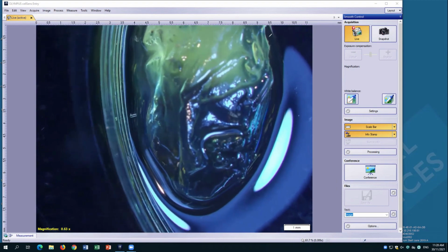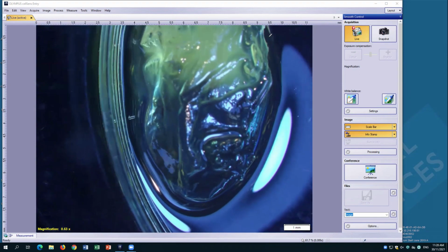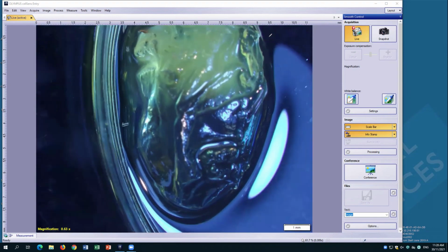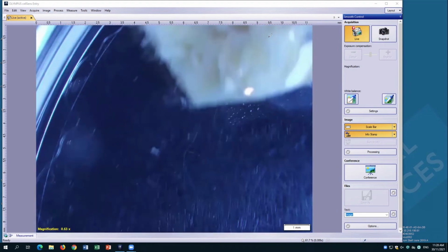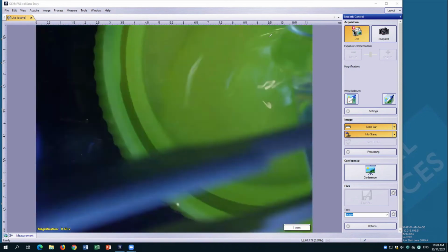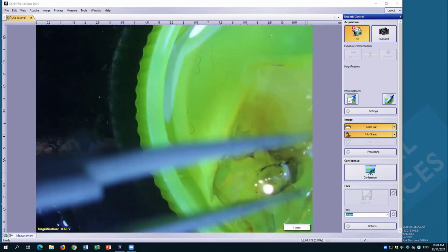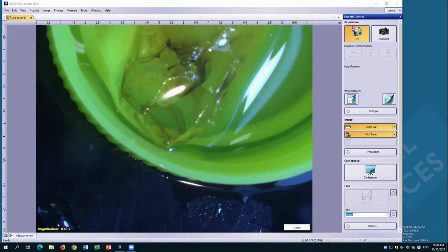So the whole cochlea, including the bone, so we've still got the bone, has been made transparent using a tissue treatment. And the amazing thing about it is that it's been immersed in a solution sequentially for a whole week to make it transparent. And it doesn't look that clear there, but if I get it all in here, see how clear it is?